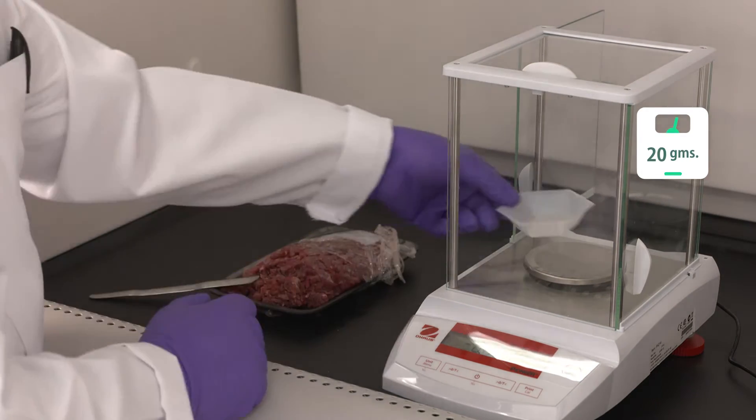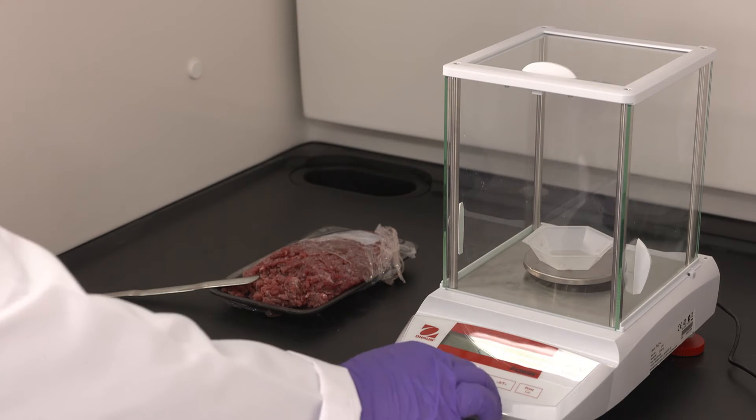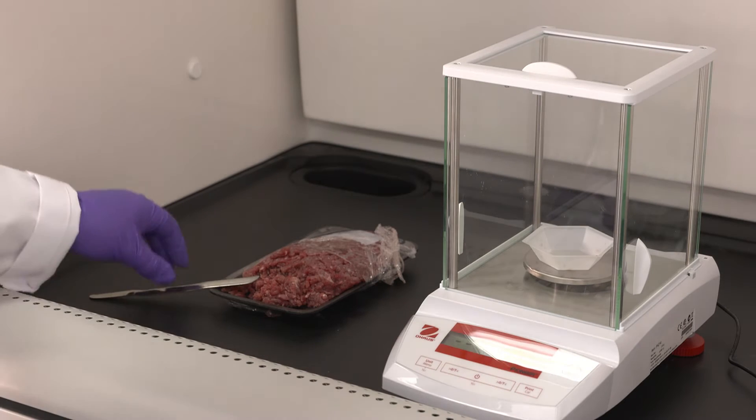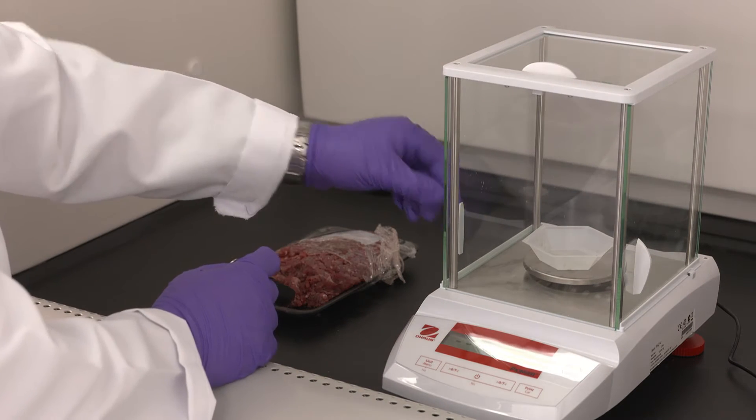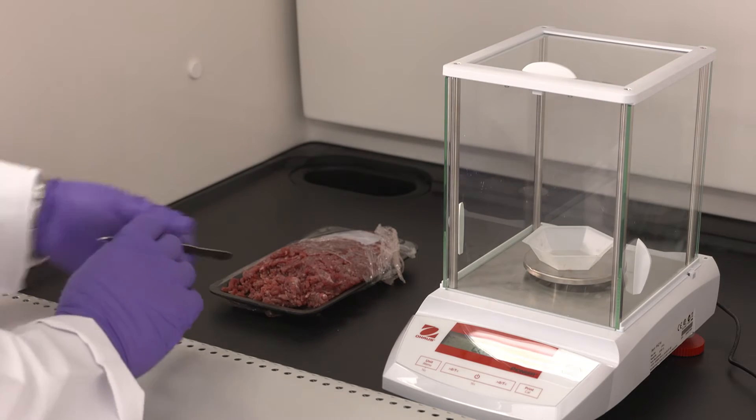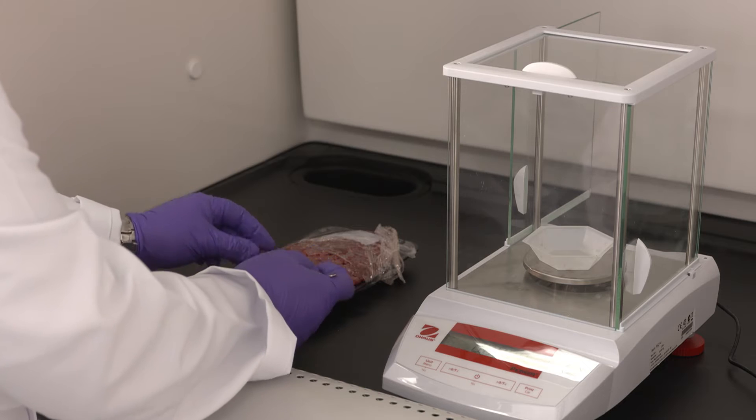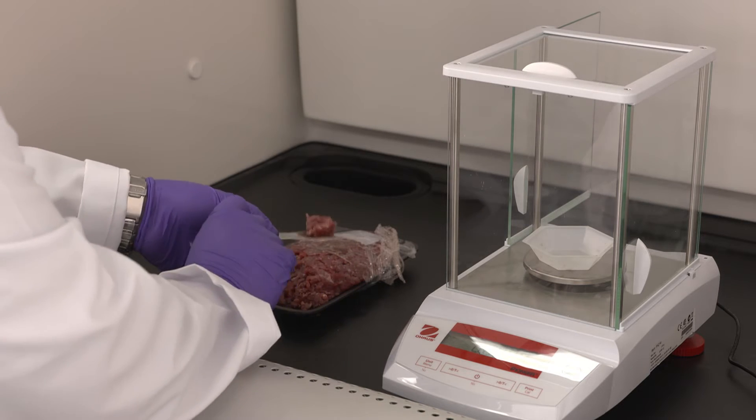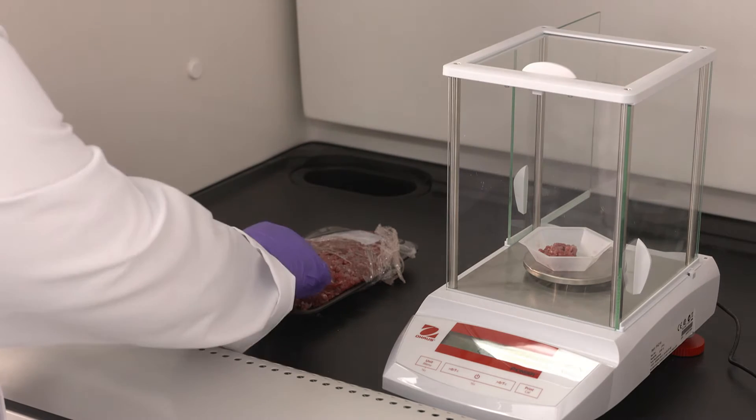We can scale up or scale down the amount we weigh. We can use as little as 2 grams or scale up to 200 grams as long as we keep the ratio between meat and the homogeneous liquid constant, which is a ratio of 1 to 5.